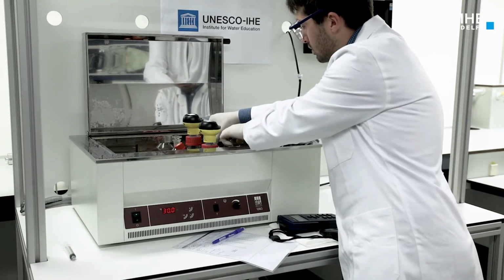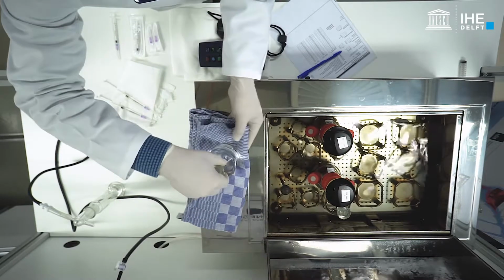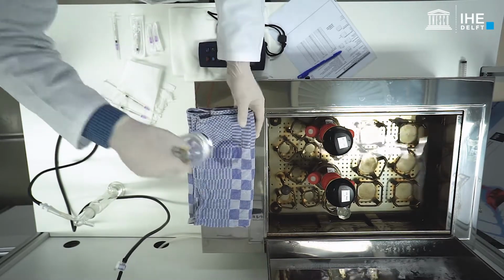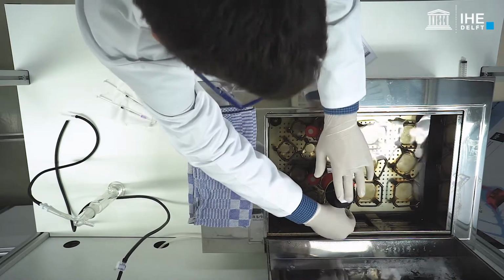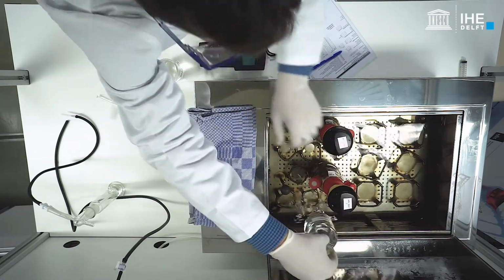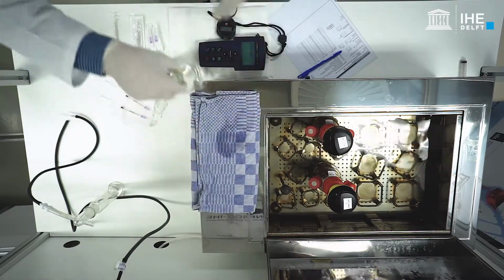To be able to calculate the endogenous gas production rate by linear regression, activate the data logging at the start of the test and wait until enough data points are acquired. Thereafter, remove the stock solutions from the water bath and prepare to inject the solutions into the reactor.